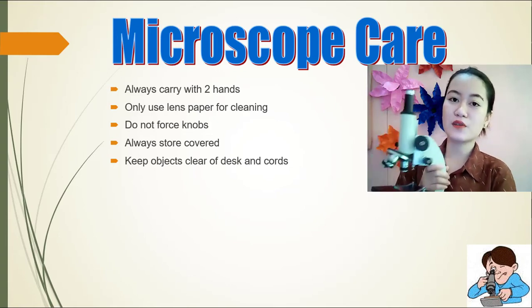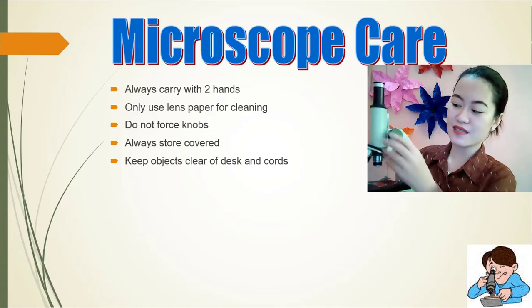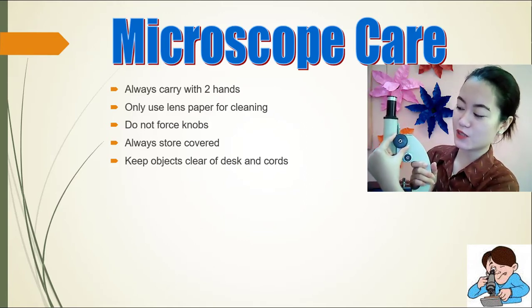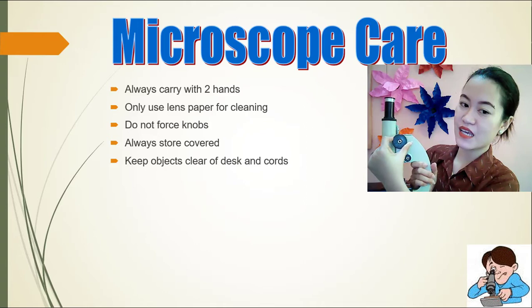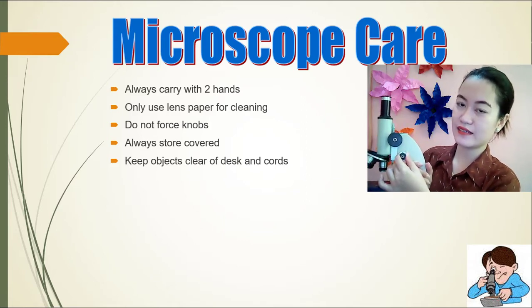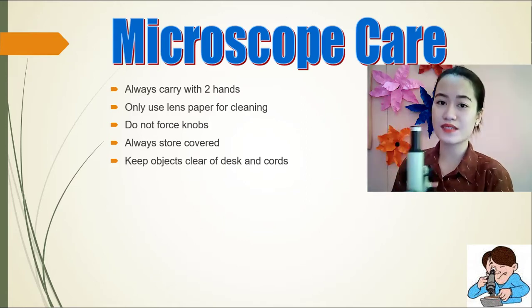Okay, what are those knobs na tinutukoy? This coarse adjustment knob, etong bilog na to na malaki. And then this another knob which is the fine adjustment knob. This is the fine. So do not force this too.